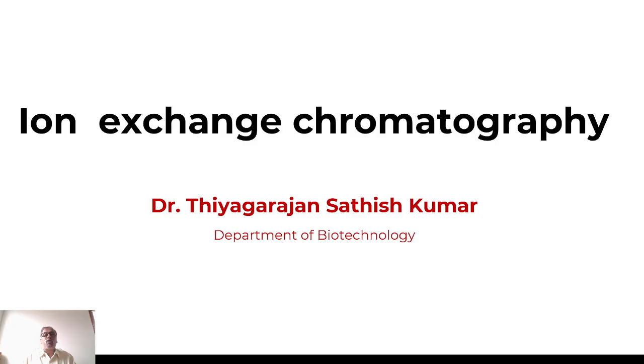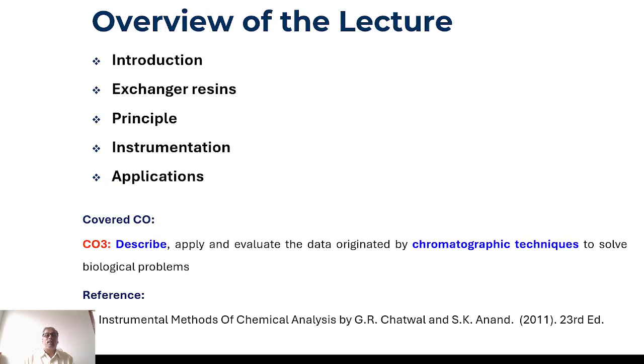So what type of molecule you want to purify, what type of molecule you want to separate. First, you should have a background idea whether you know the molecular weight or the molecular size, or the polarity index. If you know at least a few parameters about your molecule of interest, then it will be easy for you to select the appropriate chromatography. Before selecting the chromatography, you should not select crudely. You should have some idea about the properties of the molecule which you are going to separate.